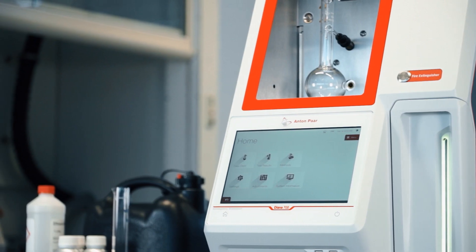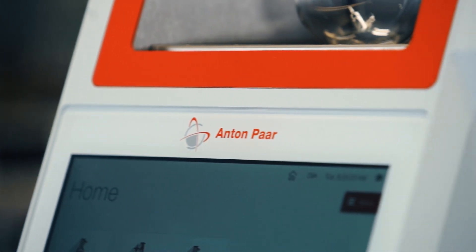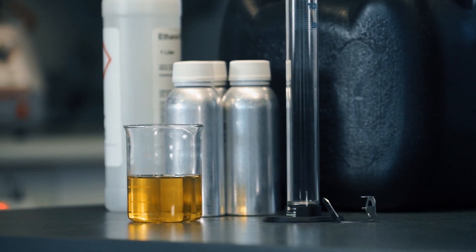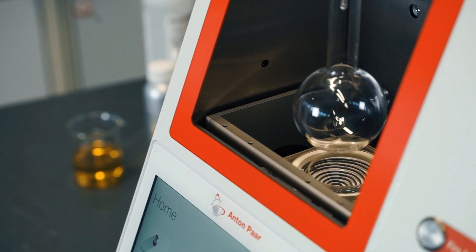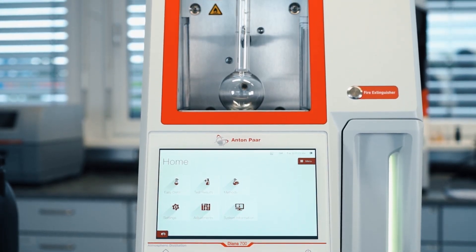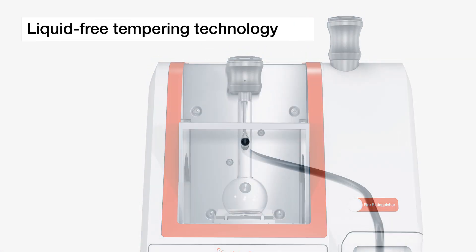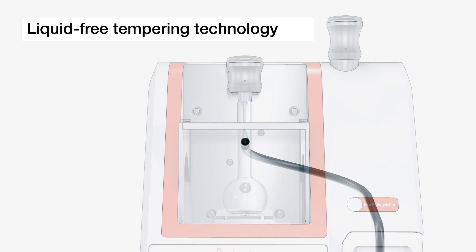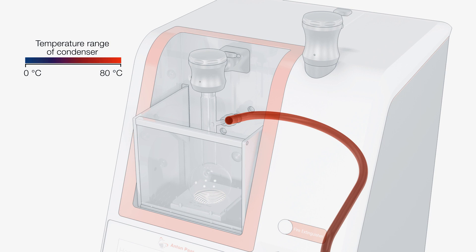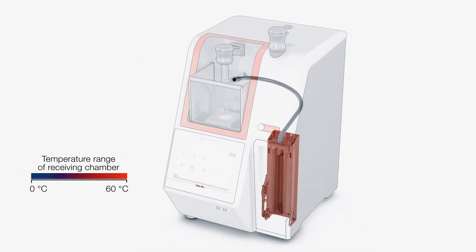Anton Paar's distillation unit Diana 700 is the ideal solution for performing high-precision atmospheric distillation tests on petrochemical products. The instrument is small and robust, as well as eco-friendly, which saves you a significant amount of money due to low running costs. Using the highly efficient Peltier technology, Diana 700 enables a fast switch between different distillation groups of ASTM D86 and reaches the required temperatures in a very short time.